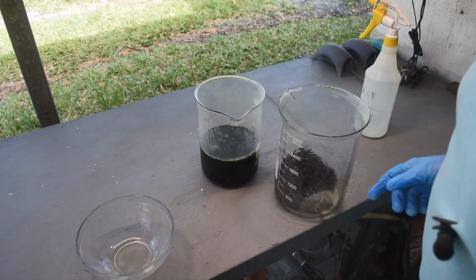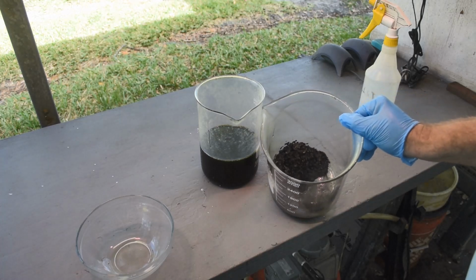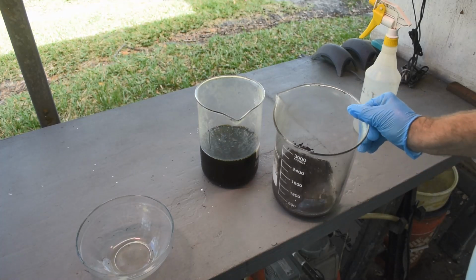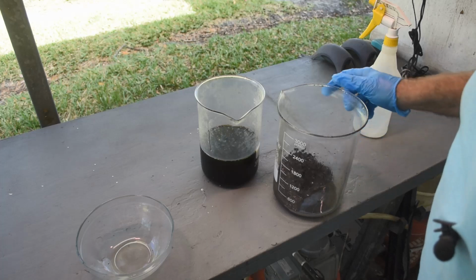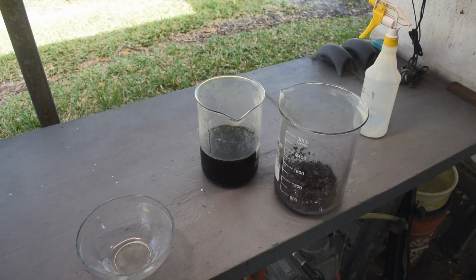And I can tell that we got rid of a lot of iron because this stuff looks even more coppery than it did before. So the copper is really starting to show through there. But I'm going to give it at least one more treatment just to be sure we get the bulk of the iron out of here before we move on to nitric acid. Or probably poor man's nitric acid to start with, I'm thinking. Then nitric acid at the end. Okay, so let me get this back in the fume hood and we will go again.